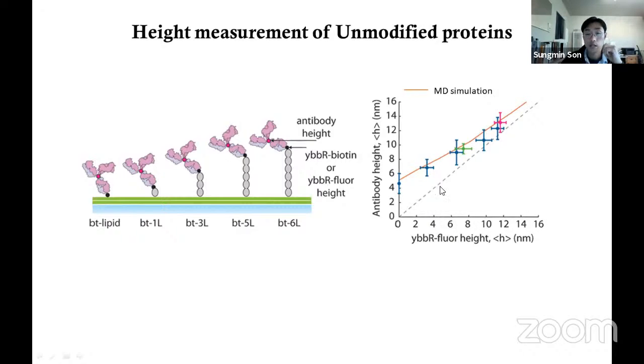And I could see that there is a very predictable positive offset between the tip and the antibody. And using MD simulation, we confirmed that the only parameter that predicts this offset is the antibody height, right? Antibody can be bound in the middle of these tall proteins, but still the offset between the antibody location and its epitope will be just a function of antibody height.